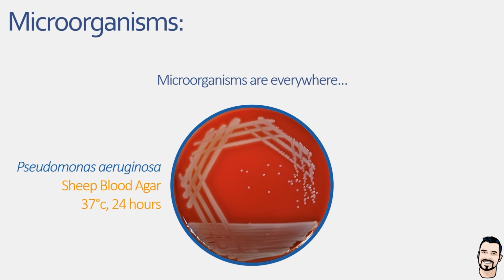Just like if you were to look at a friend, you could see them, but not the individual cells that make up that person. And so despite seeing this collective group of cells, I can't tell you the shape of these bacterial cells, I can't tell you their definitive size, I can't determine whether these cells are motile or unable to move, and I don't know if they have any specialized structures.